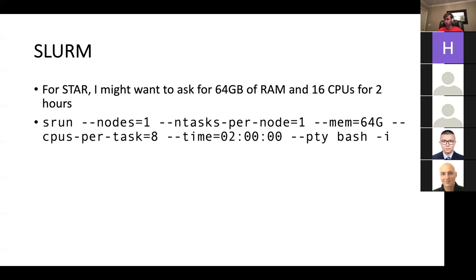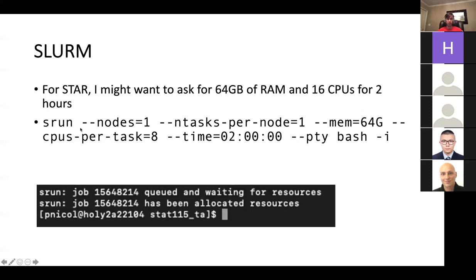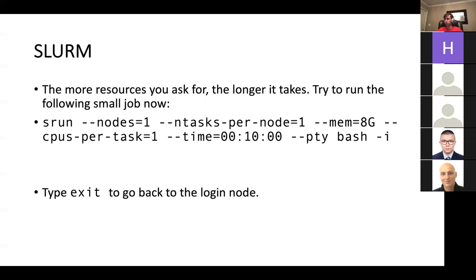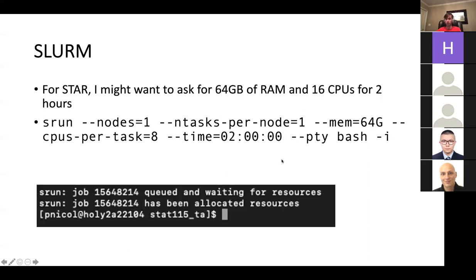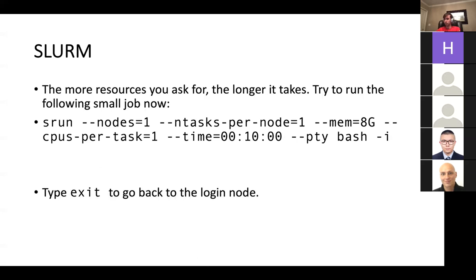So if you type this in and press enter, first you'll see srun — this job has been queued and it's waiting for resources. Next, it gets allocated the resources, and then all of a sudden you have this new ID for what node you're on. It says 'holy', which stands for Holy Oak, and it's not a login node — you've successfully gone to the compute node. This can take a moment or two. For those of you on Canon right now, I was hoping you could try putting in this job, which is a very tiny job — it's only asking for eight gigabytes of RAM for 10 minutes.